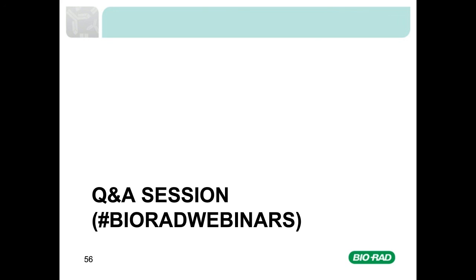What you do need to keep in mind, however, is that it's very hard to accurately determine the molecular weight of any protein on a native gel because the migration of the protein is dependent on its size and its native charge. There are some molecular weight standards available which are suitable for native gels, but again, it's a compromise. A good reference would be to load a purified or recombinant version of your protein onto the native gel. You can then compare this with your IP sample, and it could give you an indication of whether or not your protein is part of a complex. You could also go further, actually, and blot this native gel and then probe it using Western blot techniques.